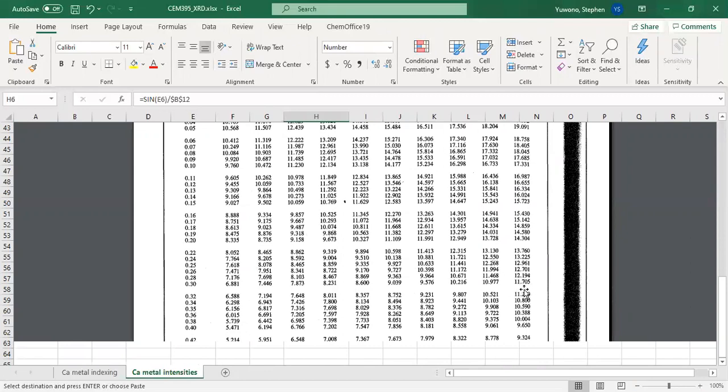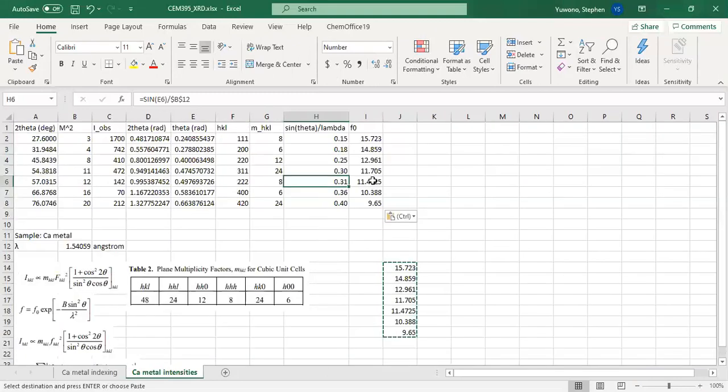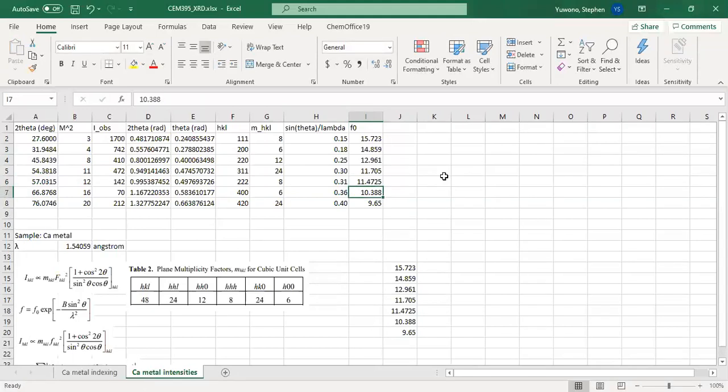So it should be in between these 2 values. And that's exactly what I do here. I take the value for 0.30, I take the value for 0.32, and I average them, and that's my estimate for 0.31, assuming linear behavior in that interval, which is not bad actually, right?